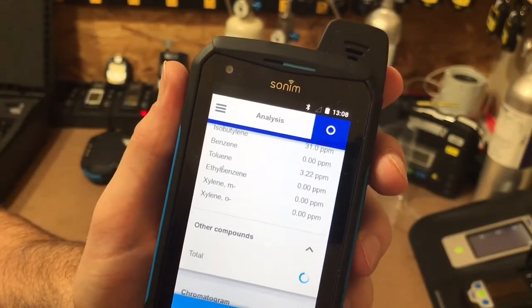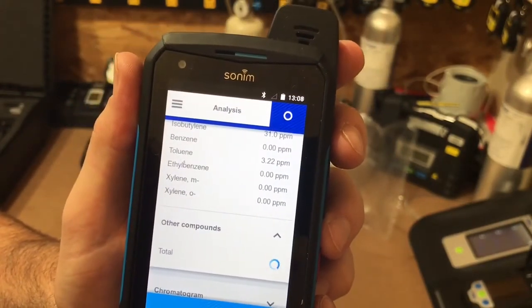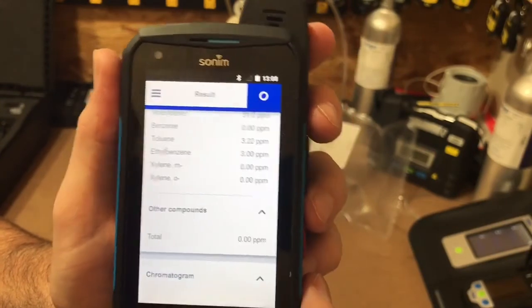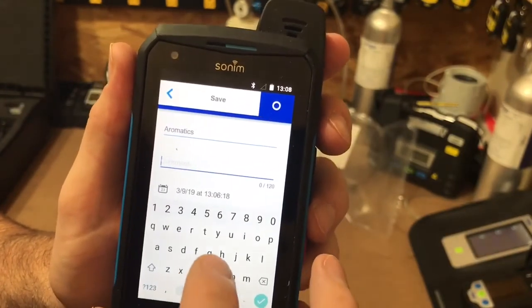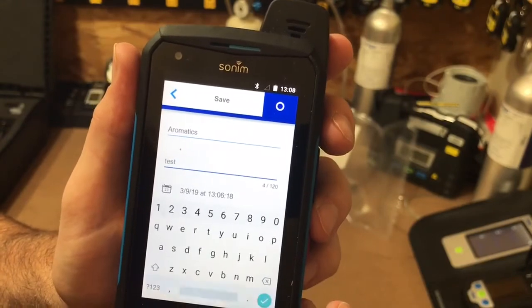Let's see if there's any other compounds in here. Once we're done, we can save it into the folder. I had it under aromatics, but we can just make a little comment — click it, test, save.